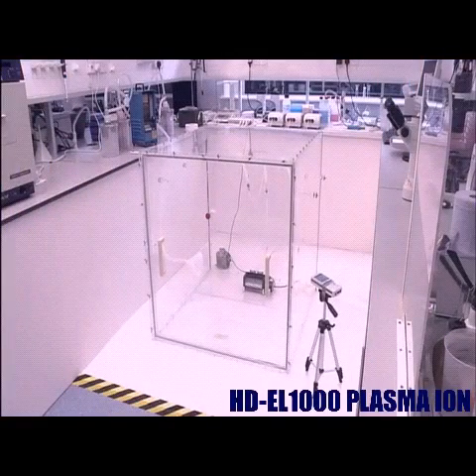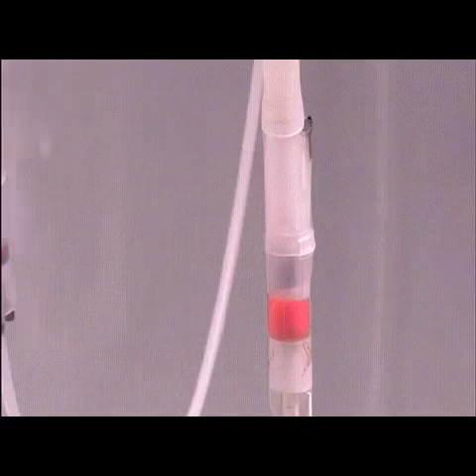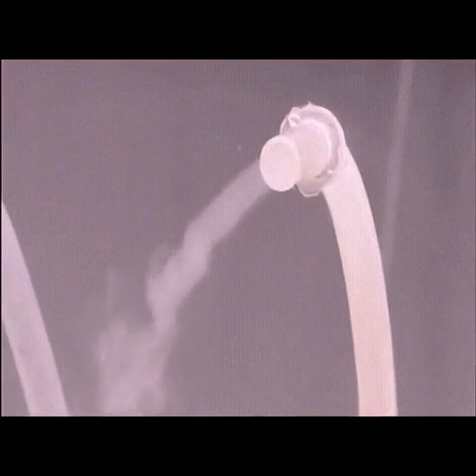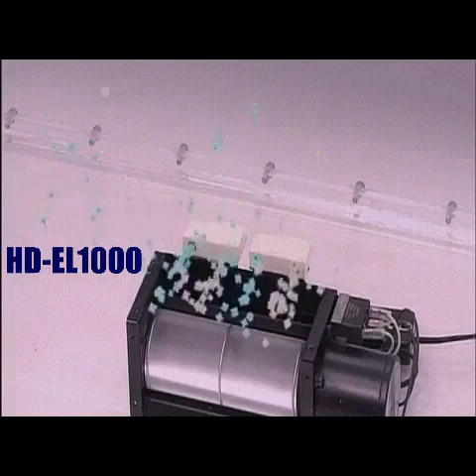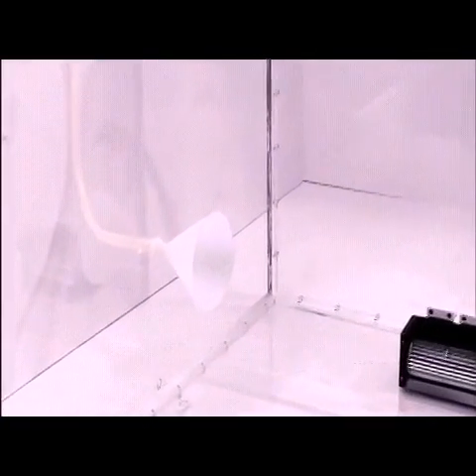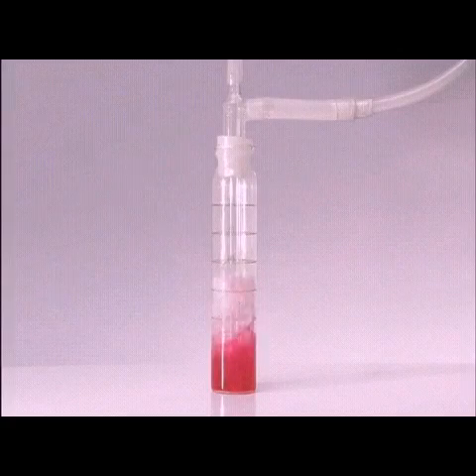The experiment is carried out using a 1-meter cubed box. First, virus solution is sprayed from the top surface of the box. Within the box, an ion generator is producing plasma cluster ions. The suspended viruses are gathered at fixed intervals into a solution by a trumpet-shaped collection device.